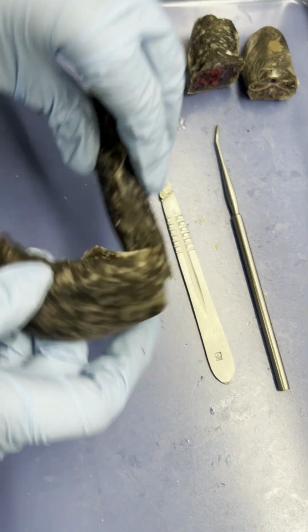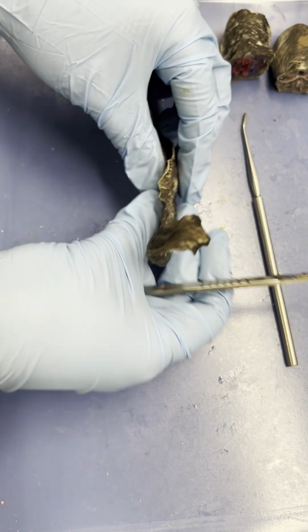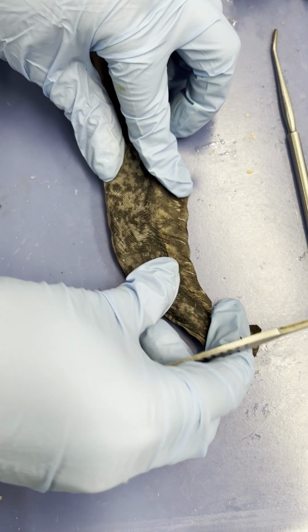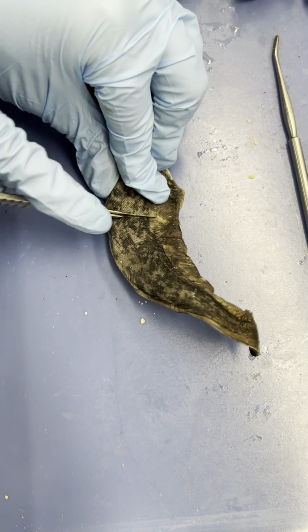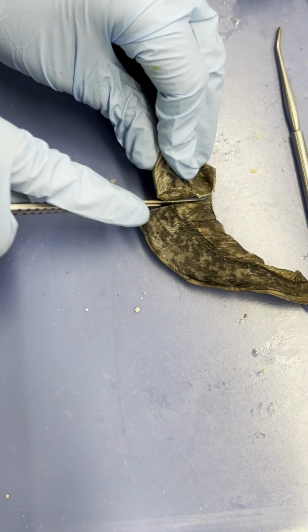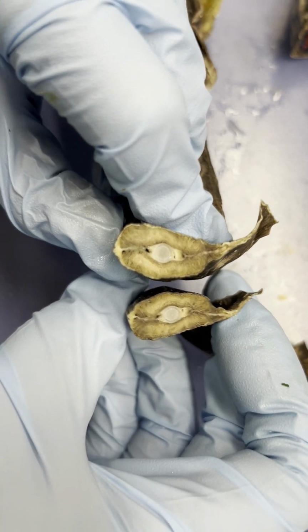And then last but not least, we need the tail, which is generally one of the easier cross-section cuts. Now, since the tail is so thin and we have this dorsal fin, cutting up top this way can be a little more difficult. So it's okay for this one if you lay it on the side and just try to make a pretty good cut there. And so we got the most important parts. I just need to cut the rest of our fin, so that part's easier. There we go. Let's see what we have for this last one. All right, these are looking good, but we'll find out for sure very soon.